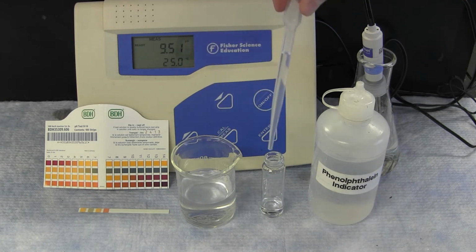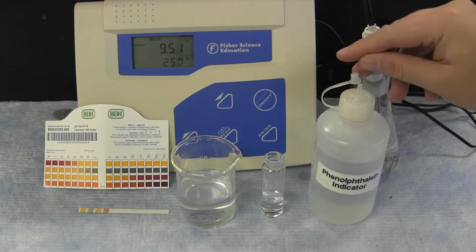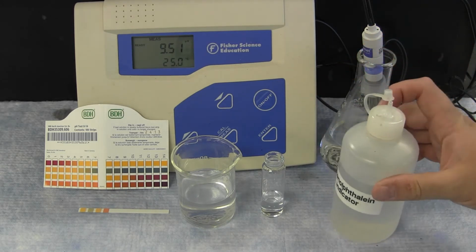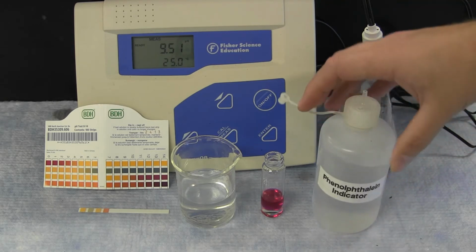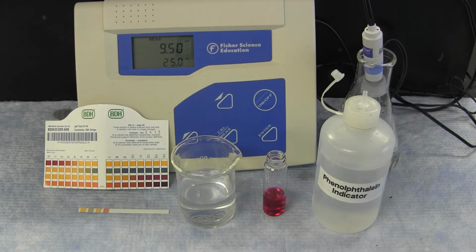This particular pH indicator, phenolphthalein, is colorless in acidic solutions and a bright pink in basic solutions. Based on the color change, this indicator can tell that the solution in the beaker is a base. However, it does not give a specific pH number to determine concentration.